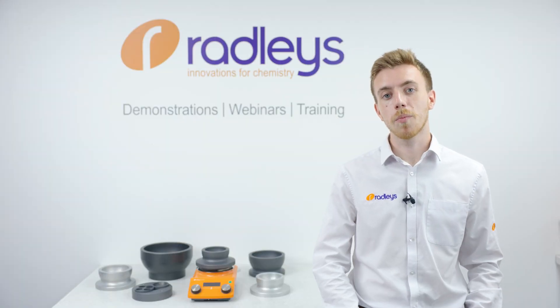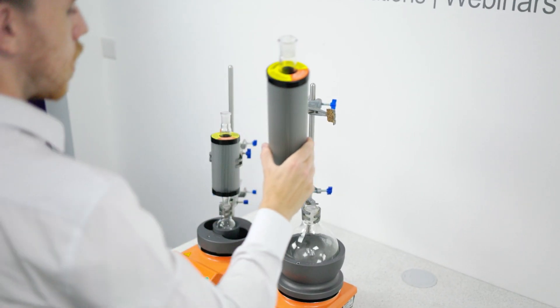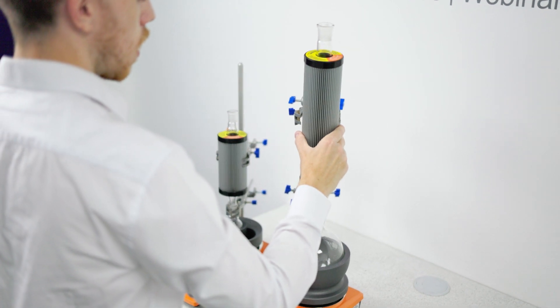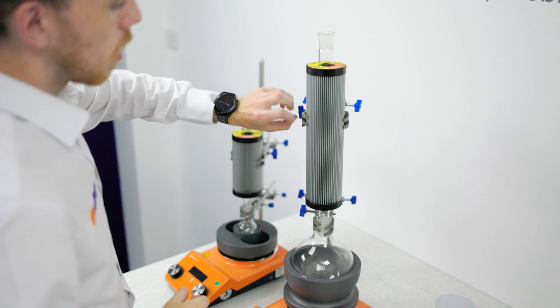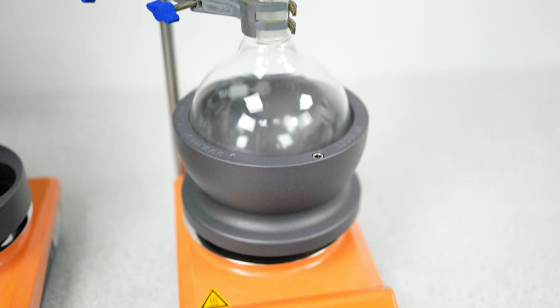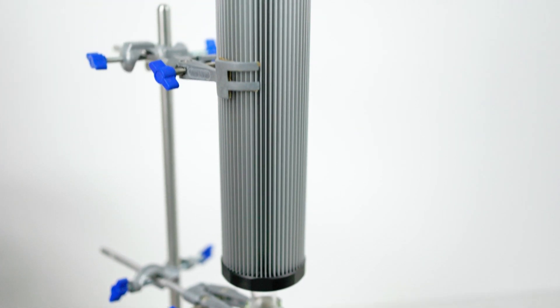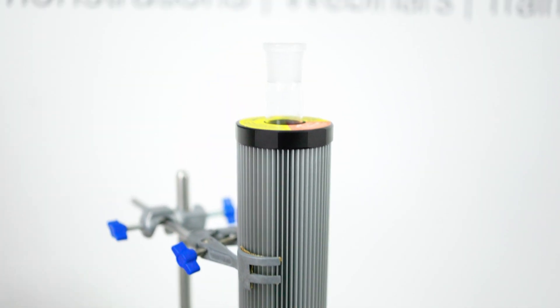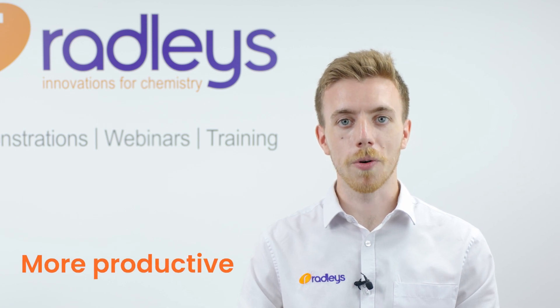Complete your reflux setup with a FINDENCER — the super air condenser that needs no running water. FINDENCER uses a finned aluminium jacket to efficiently dissipate heat, and it's actually so efficient it retains solvents at least as well as traditional water condensers for lab solvents like DCM, acetone and acetonitrile. And no more fiddling with jubilee clips to avoid leaks or even floods. This equipment takes no time to set up and is safer, cleaner, greener and more productive.